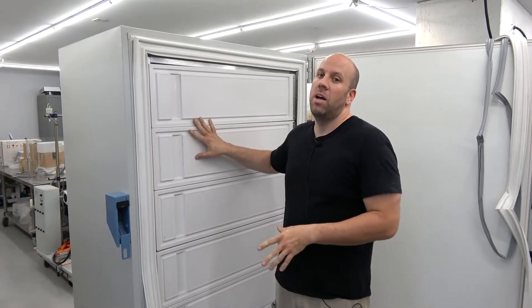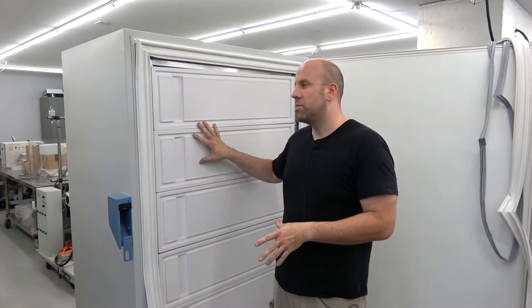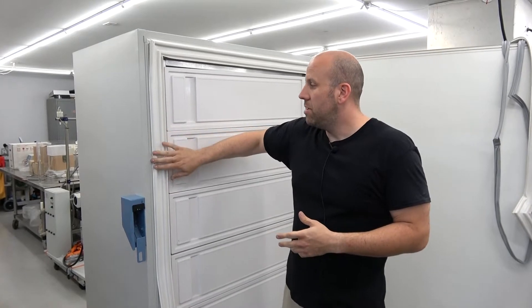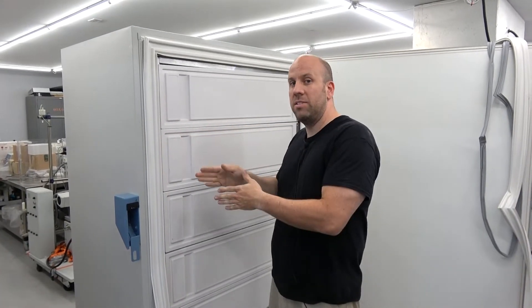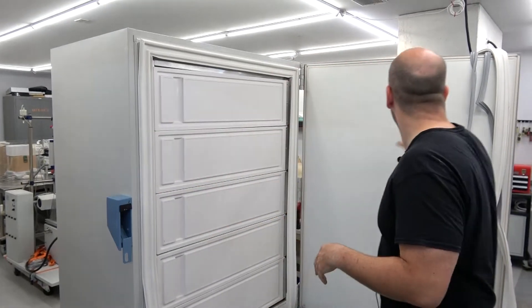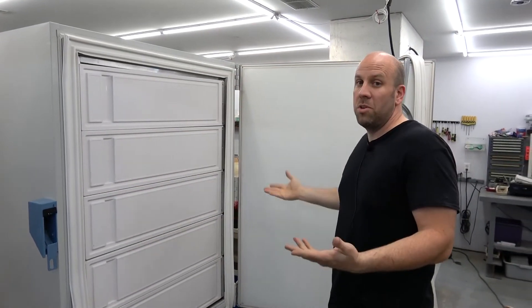This is a Thermo Ultima Plus freezer. I can't speak to all different models, but Thermo generally doesn't use adhesive for their seals. It just fits right into slits in the door itself. So it's something you can do yourself.